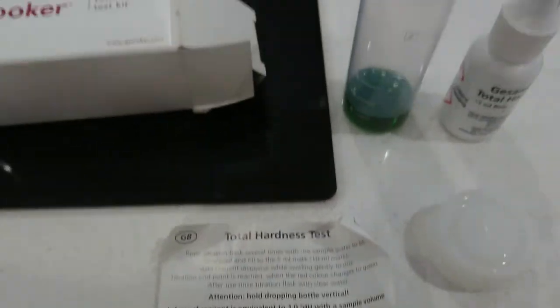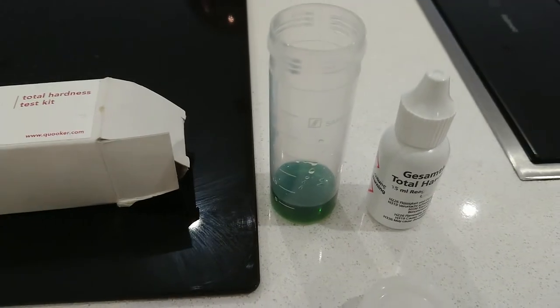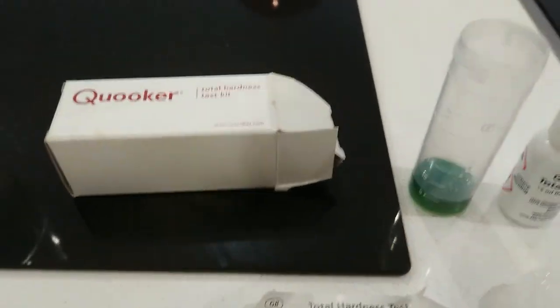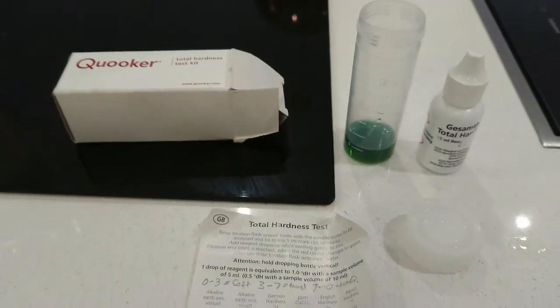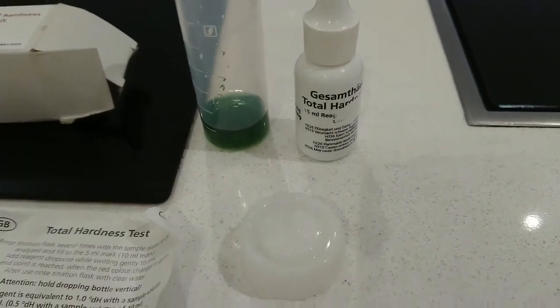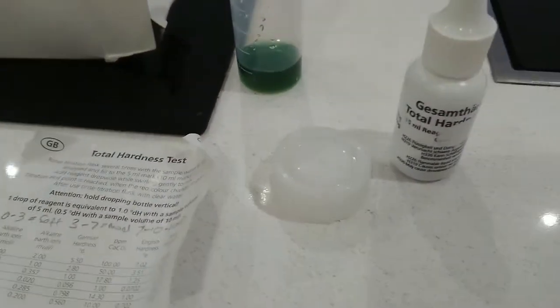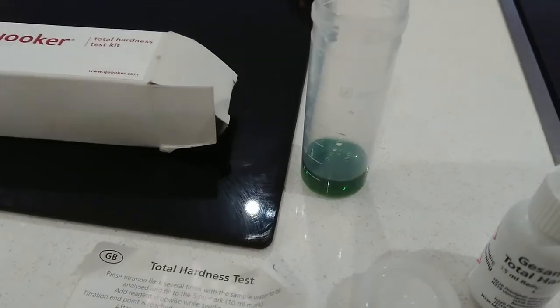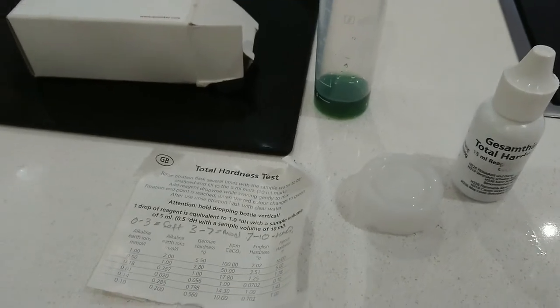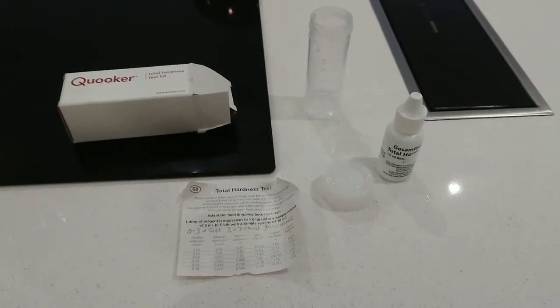Basically what you need to do is take the receptacle, rinse it out, put the water you want to test in it, and then drop the hardness tester in until the water changes back to green. It comes out green at the start but the water will go red. I'll just show you - I've done this one, I've just filled that with a new water sample.